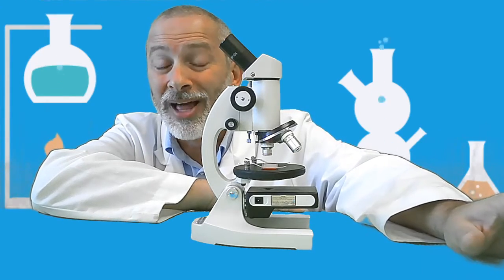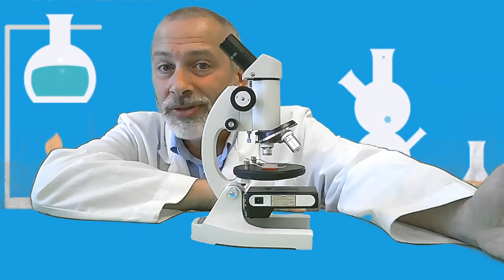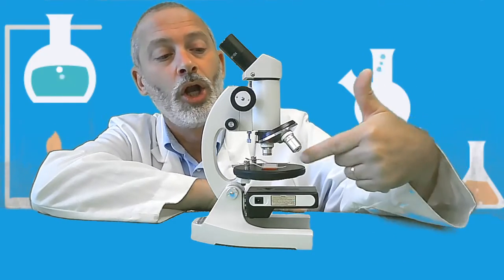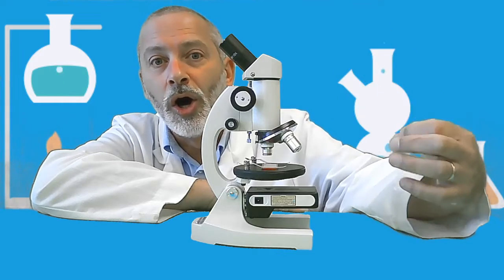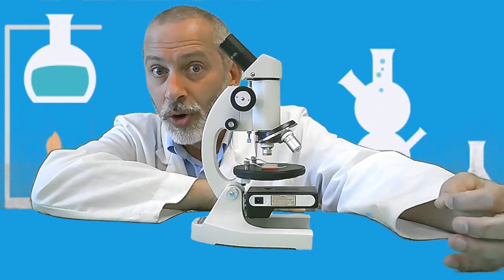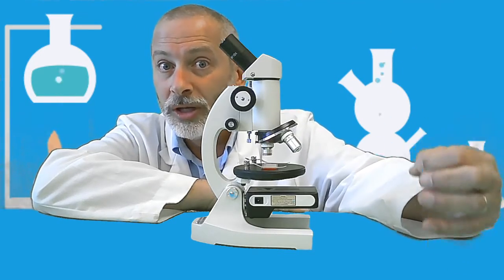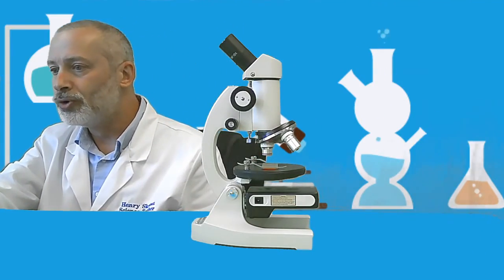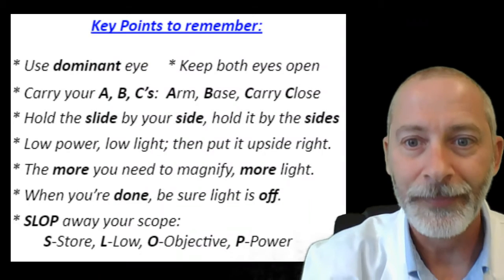And you don't want to be blinded. You want to be able to see the specimen on the stage. So always start low power, low light. You'll have opportunity to crank it up later on.